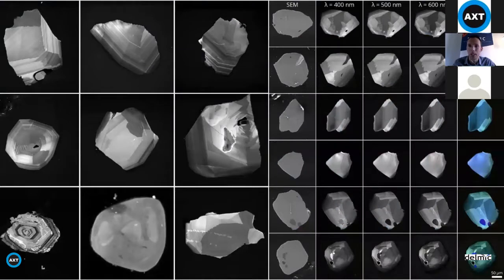Yes, and so you can image, of course, a lot of zircons, and it's quite easy because they are efficient CL emitters and also very robust. So you can also use high currents. And here's a mosaic of a lot of different types of zircons. You can see the zonation patterns. Sometimes you can see inclusions, like here, for example, which has clearly a different color than the surrounding zircon. In some cases, you can also see clear effects of radiation damage that are present.